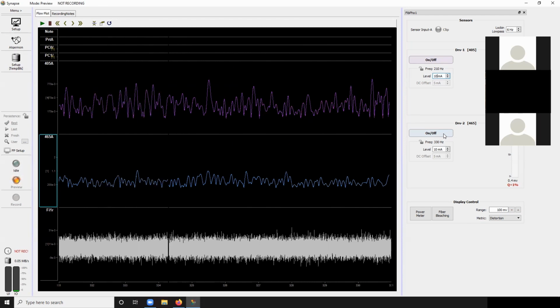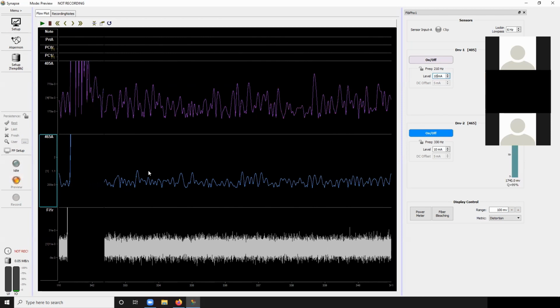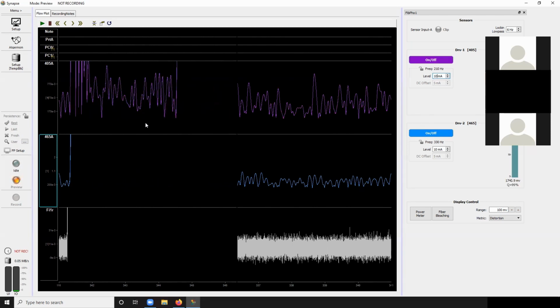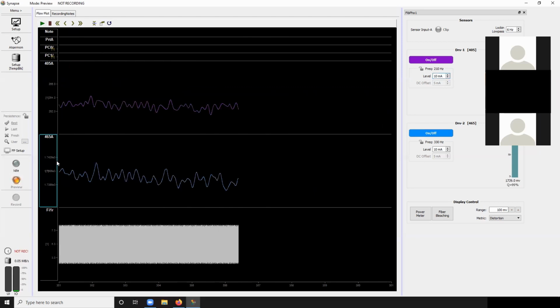The reason why I knew something was wrong is because the PM1 has fluorescent slides in it. So when I turned on the LEDs, it didn't jump up crazy like it did just now, which you would expect. So again, holding shift, dragging, you can see here, it really jumps up. Or I can auto scale like that, and then it'll hit where I'm looking for.